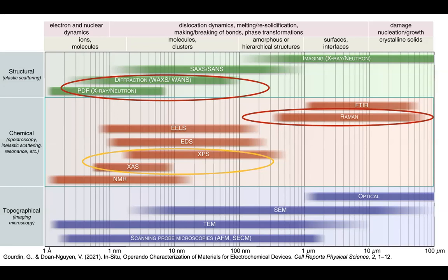So we'll talk about XPS as it relates to XAS because there's a lot of similarities given that they're both spectroscopic techniques. There are differences, obviously. That's what we'll talk about and why one would utilize one technique over the other, or rather sequentially order them in terms of accessibility and what kind of information you want to get out of it in terms of materials diagnostics.